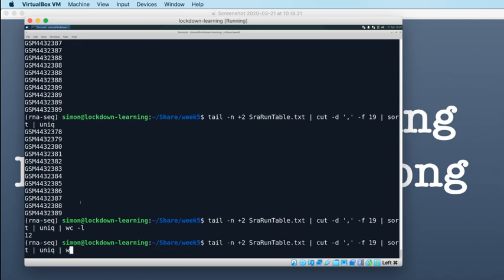So we can use cat to read them in as input for our for loop in the script that we're going to write. So let's put these into a file. So let's put them into a file called geoaccessions.txt.